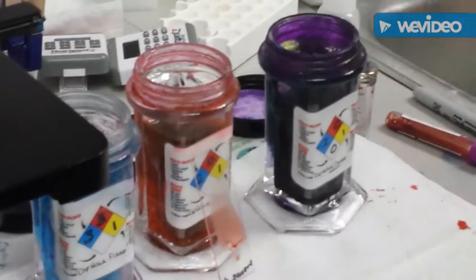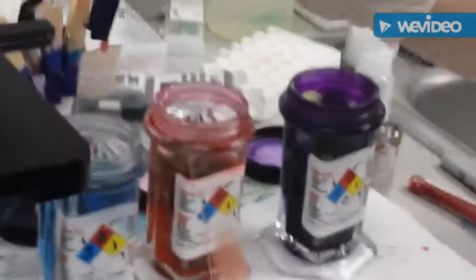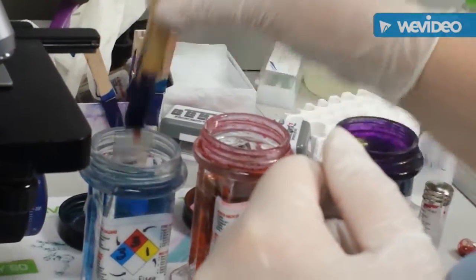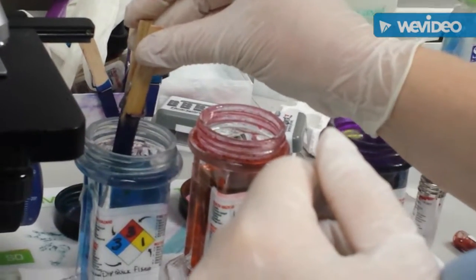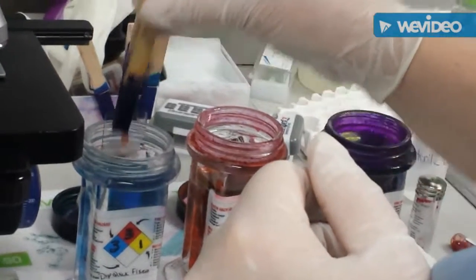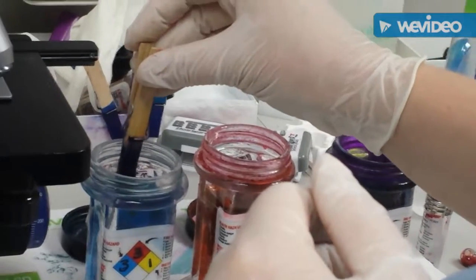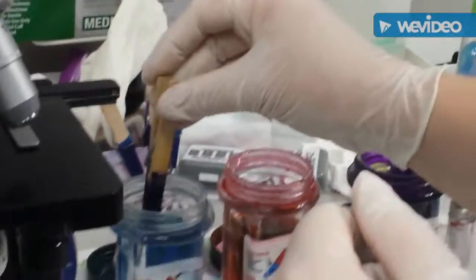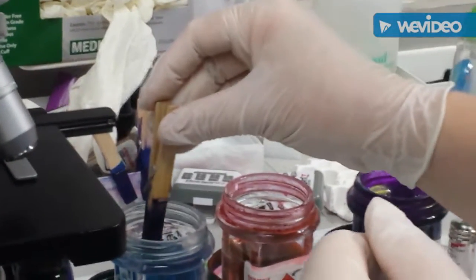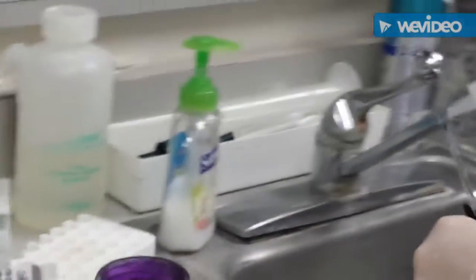So now the next thing that we're going to do is we are going to go ahead and stain these. So we want to do 10 1-second dips. So we're going to start with our fixer and just go ahead and dip it in there 10 times. And then we're going to go ahead and use our sterile water to rinse between each of the dips.